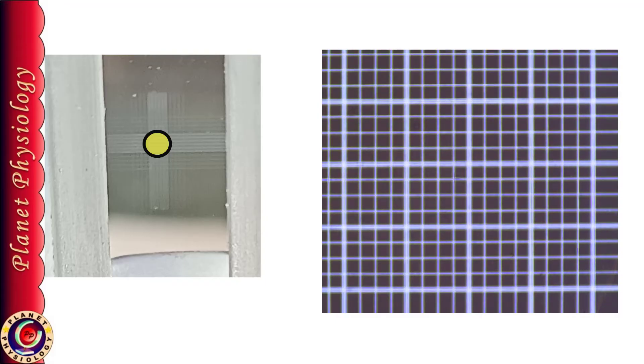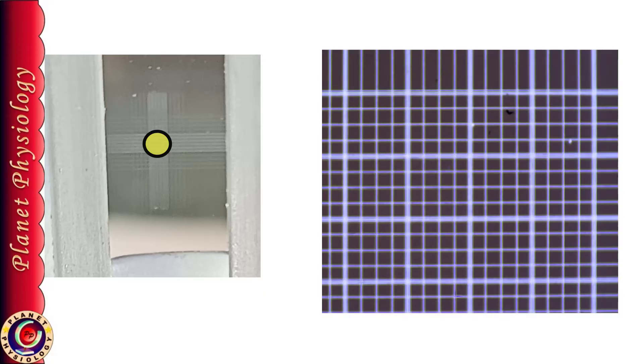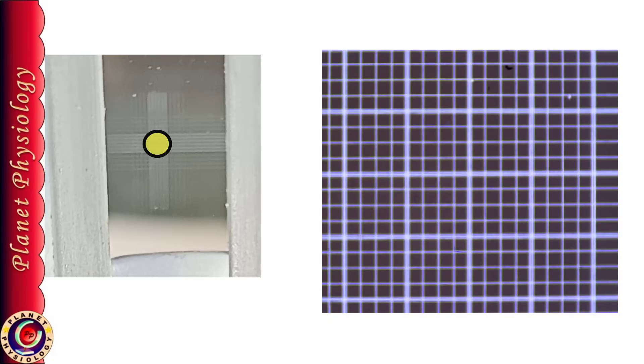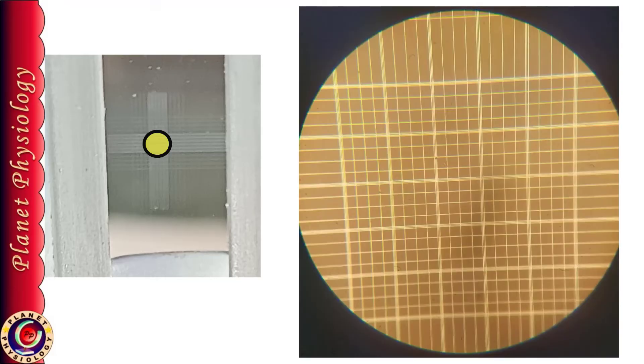Now follow these rectangles till you get small squares. Once you see your entire field is filled with small small small squares that means you have reached to the central RBC square.